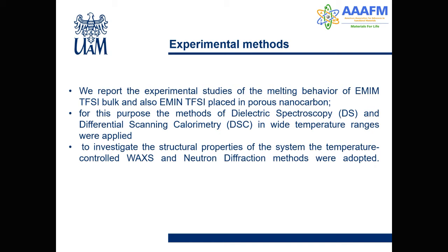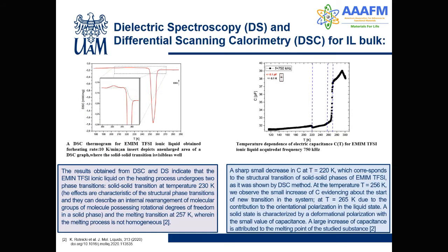As experimental methods, we applied dielectric spectroscopy and differential scanning calorimetry in a wide temperature range, and we investigated structural properties using X-ray and neutron diffraction methods. Such experiments were done for EMIM TFSI bulk and EMIM TFSI placed in porous nanocarbon.